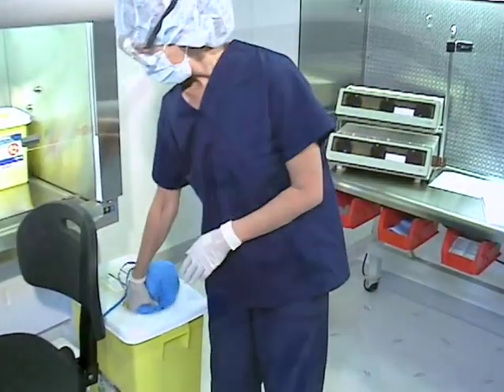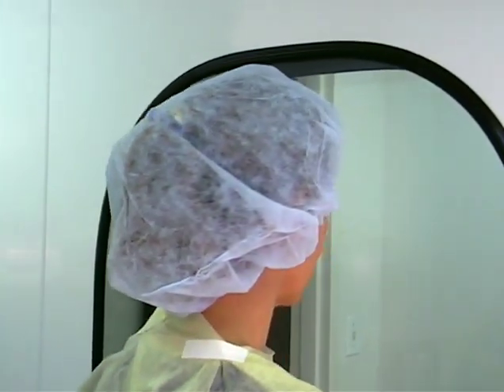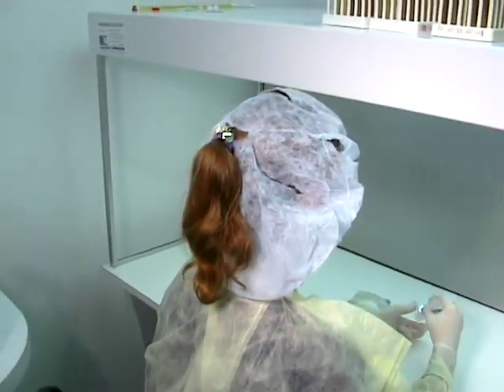Hair cover prevents shedding of hair, microorganisms, skin particles, and dander from the operator into the compounding area. The elastic closure should contact the skin below the hairline with all hair contained within the hair cover. The cover must remain intact. No tearing or opening of the cover for heat relief or for any other purpose is permitted. Remember, hair cover is not flattering, and no attempt to look good in hair cover should ever be made.